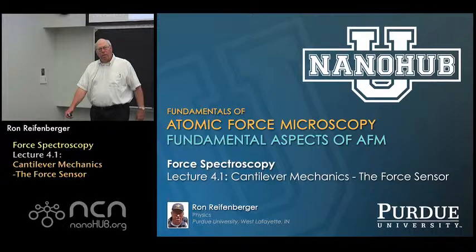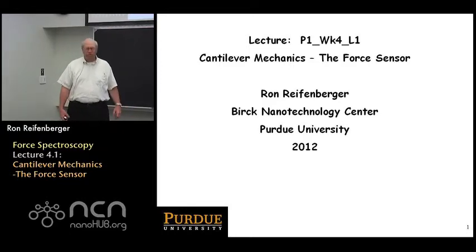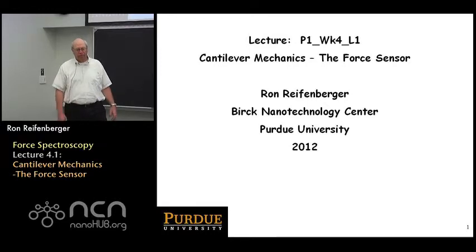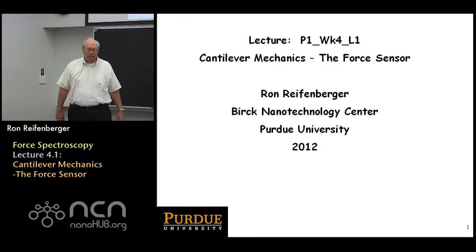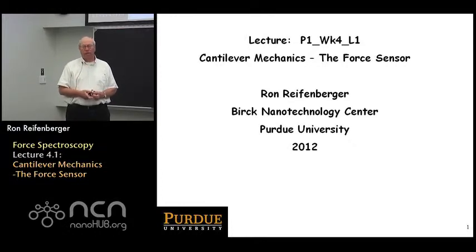nanoHUB-U, online instruction. Hi again. We're starting the fourth week of lectures in this course called Fundamentals of Atomic Force Microscopy. And in this particular lecture, we're going to talk about the cantilever mechanics. We're going to derive some of the important equations that you need to know in order to understand how the cantilever transduces a force.